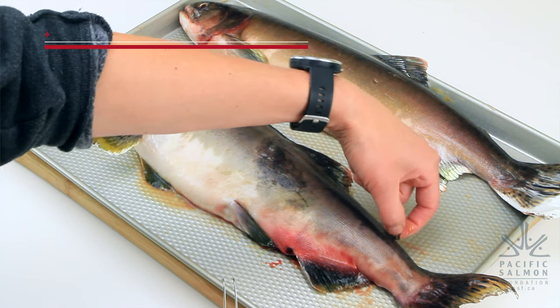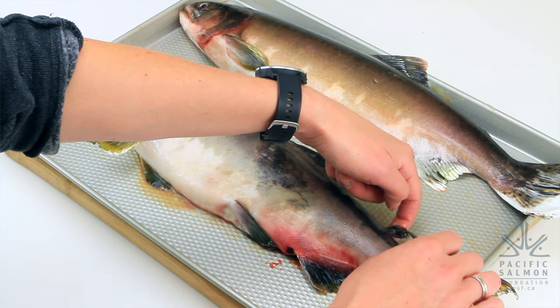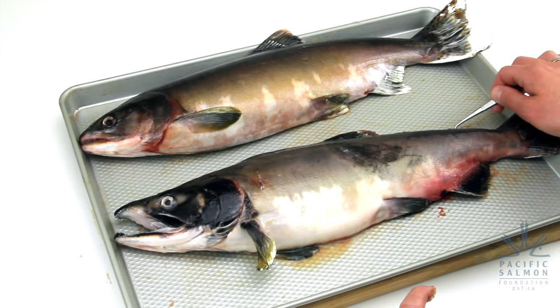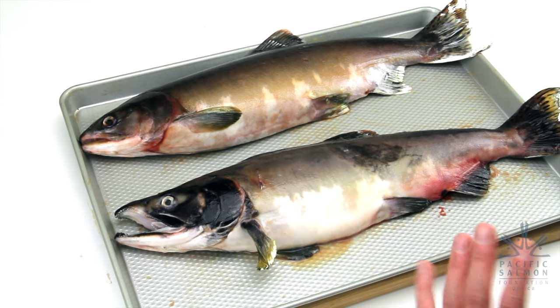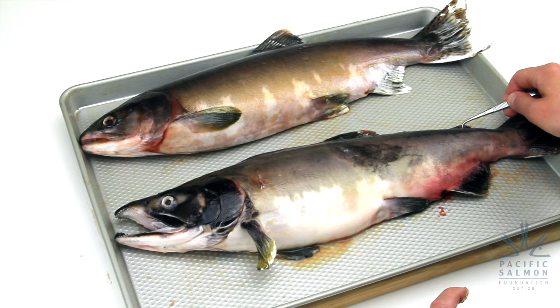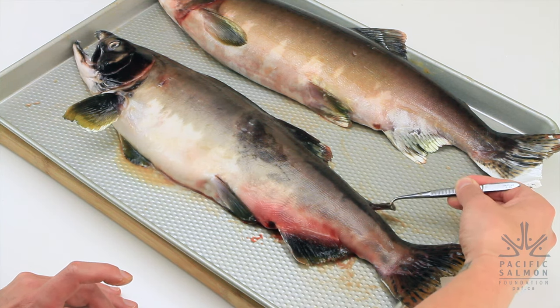The next is the adipose fin — it's a small fleshy fin behind the dorsal fin. For a long time, fisheries biologists weren't really sure what its purpose was. More recent studies have shown that this fin might be like the lateral line, acting as a sensory organ and helping fish maneuver better in turbulent or fast water. In hatchery situations, this adipose fin is clipped when the fish is just a fry, so if you catch a salmon without this fin, it was raised in a hatchery.